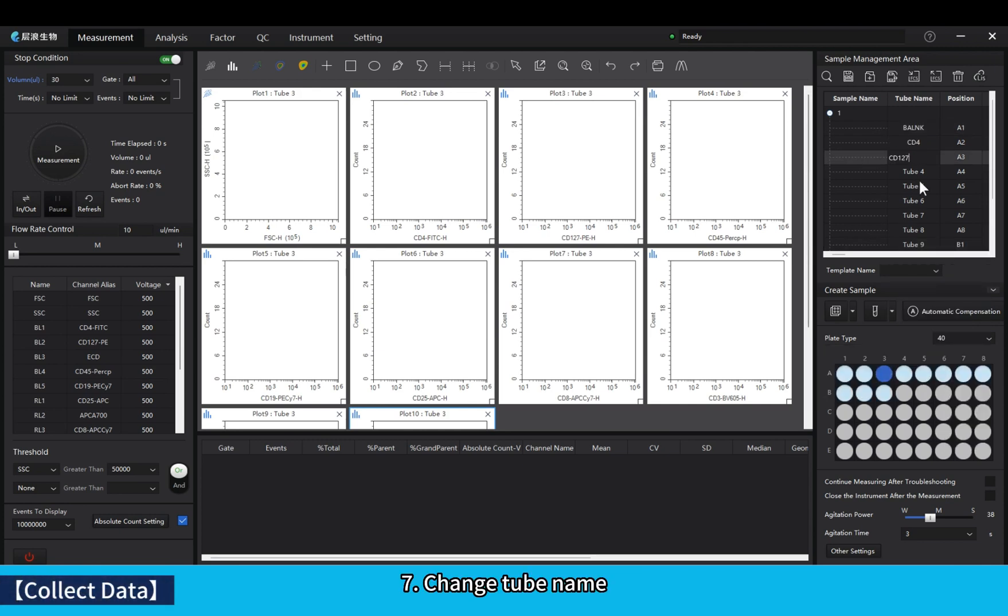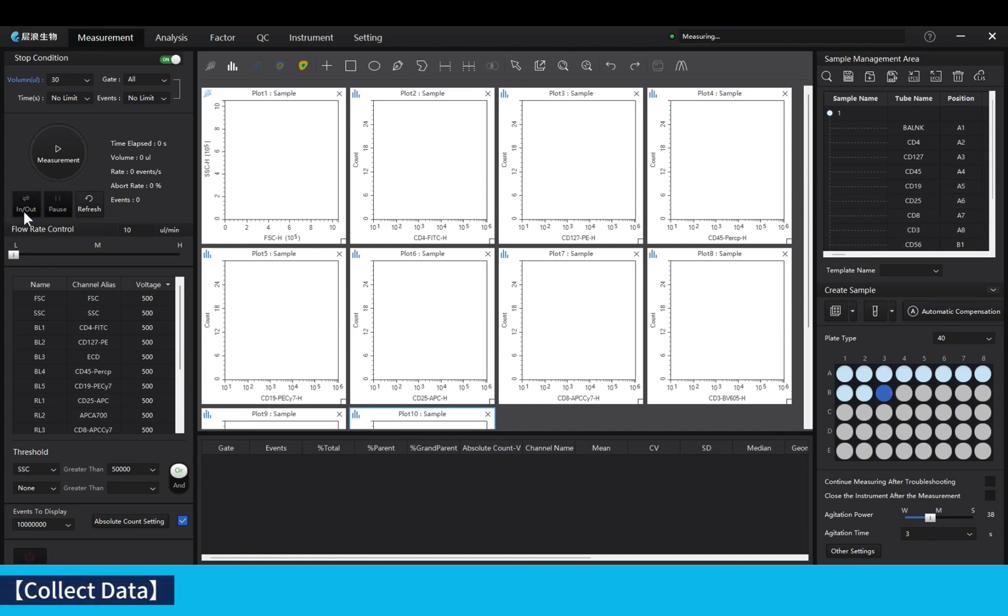Change tube name. In out the warehouse placing plate.